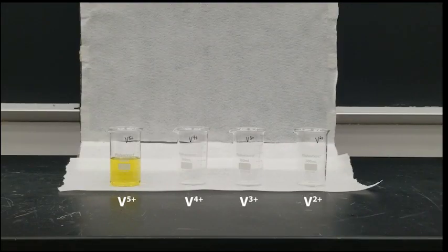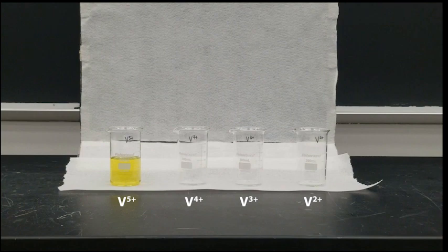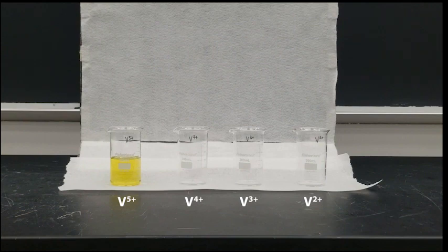Many transition metals have multiple oxidation states. Different oxidation states are often very different colors. Today we are using a zinc mercury amalgam to reduce vanadium from its plus five oxidation state to plus two and look at the different colors associated with each.